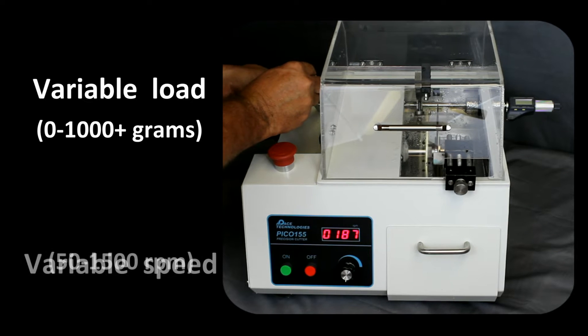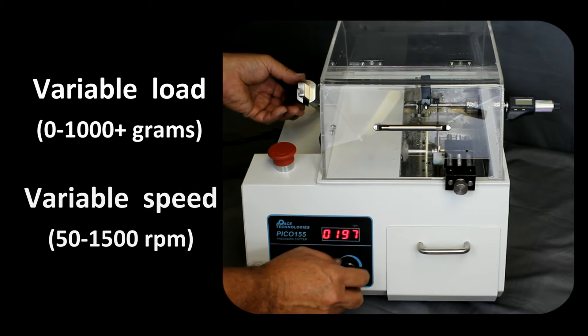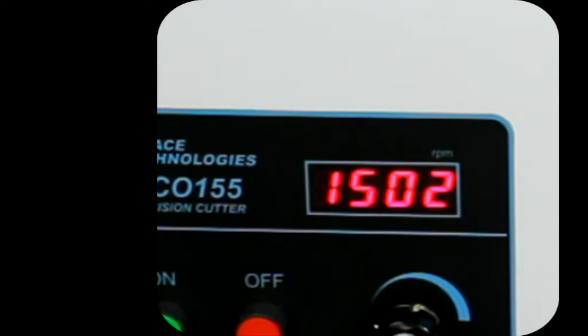It can be used at speeds as low as 50 RPM for cutting very soft and brittle materials such as electronic components, or at speeds as high as 1500 RPM for sectioning harder, tougher materials such as engineered structural ceramics and composites.